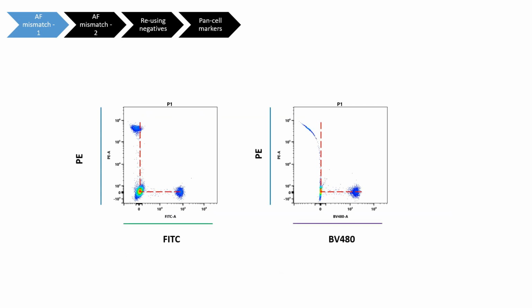So, as we can see here, the software is expecting more photons to arrive in the detectors associated with BV480 because of the incorporation of the autofluorescence into the signal. Therefore, the sample is overcompensated out of the spillover channels to degrees related to the amount of mismatch, i.e., the autofluorescent mismatch was most prominent in the violet channels, thus BV480 is most affected.